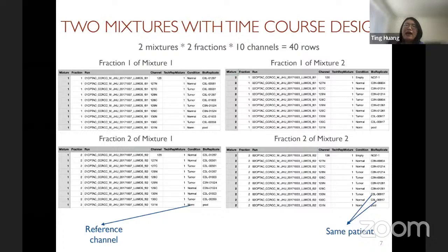You can understand it as 1 minus the interference score in PD or other tools. So for purity, larger is better, but for the interference score, smaller is better. It's the opposite of the interference score.